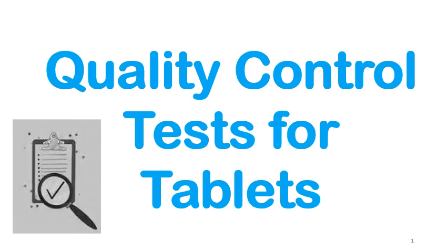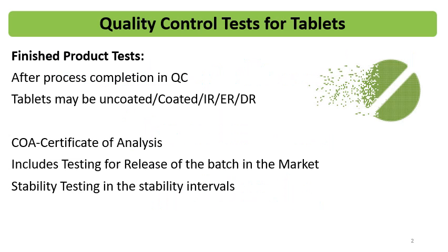In an earlier video we have seen the in-process quality control tests for tablets, and this video is regarding the finished product quality control tests for tablets. This also includes the stability testing for the tablet formulation.